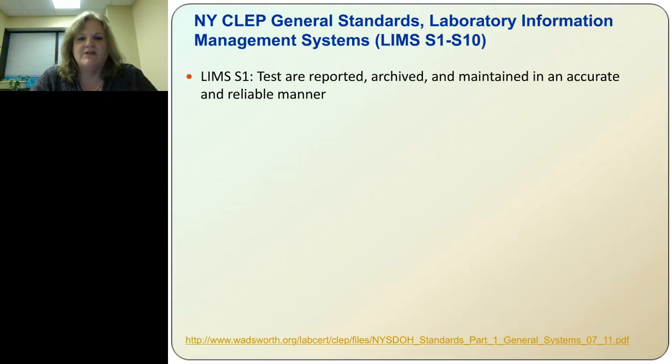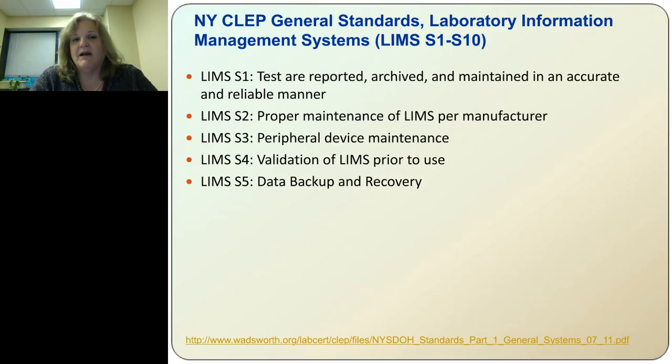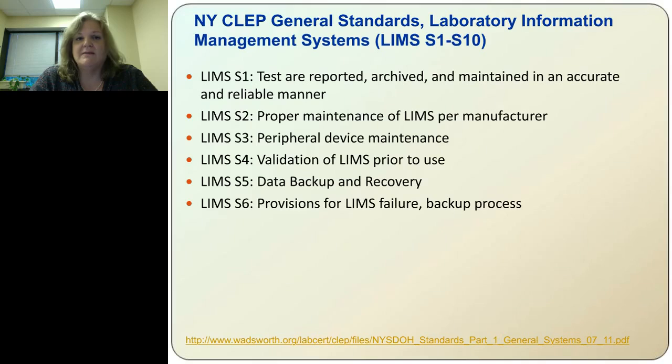But they do have requirements such as tests being reported, archived, and maintained in an accurate and reliable manner. You have to have proper maintenance of your LIMS per the manufacturer, so your LIMS has to be updated according to the standards of the manufacturer. Your peripheral devices like printers and such have to be maintained. Your LIMS has to be validated prior to use, in a manner that shows that your tests are accurately reported and data is accurately maintained. Your data has to be backed up and recovered in proper manners. You have to have provisions for LIMS failure in some sort of backup process, so if the LIMS fails, you should be able to access the data outside of the failure of the LIMS.